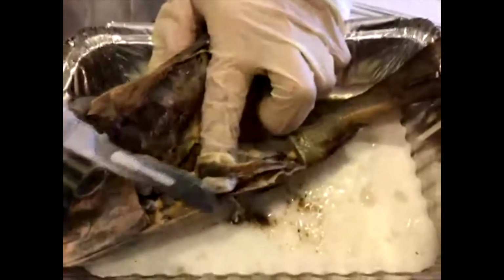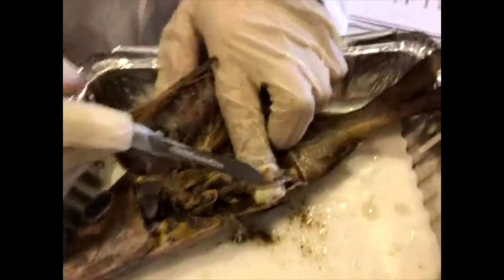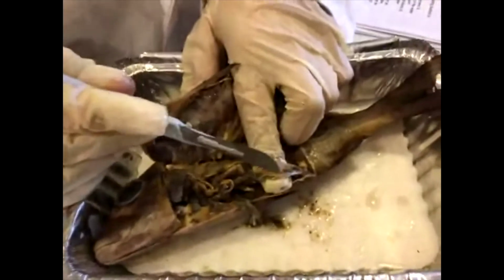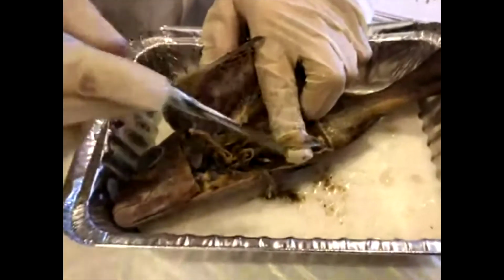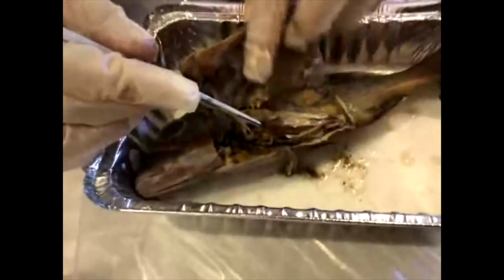This fish doesn't have quite as big of an intestine, but it is still quite a large surface area for its body size. And the reason why we want more surface area is because it gives more area to absorb the nutrients that are in there. Okay.